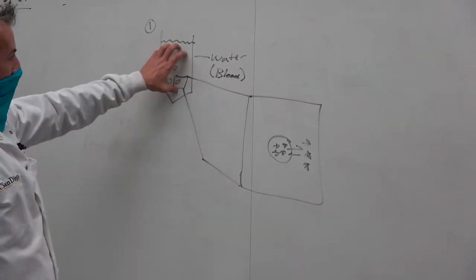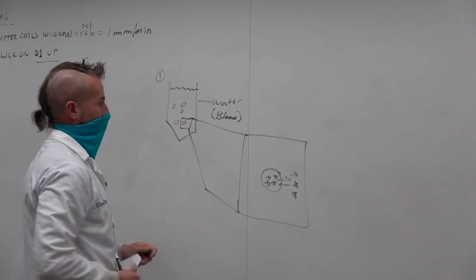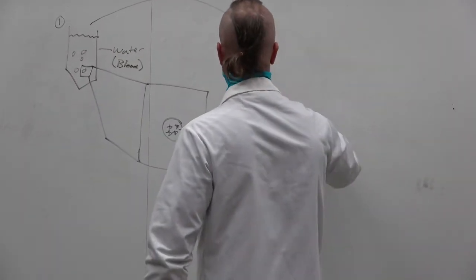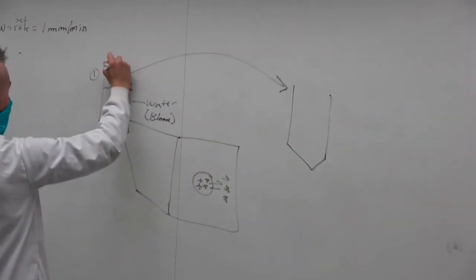So we're going to let this sit for a little bit and then come back. So this is T equals 0.